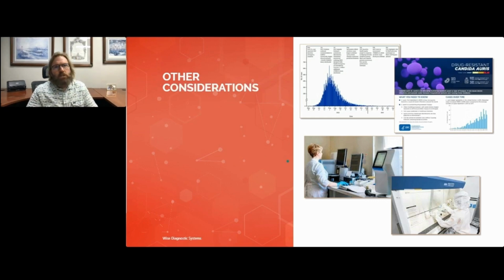Here's some other considerations, and I think it's something to really understand because of the flexibility the QuantStudio gives you. It does give you the ability to update what you've customized for your panel or add new potential infectious disease panels. But there's just some things to think about. Let me just bring these up.